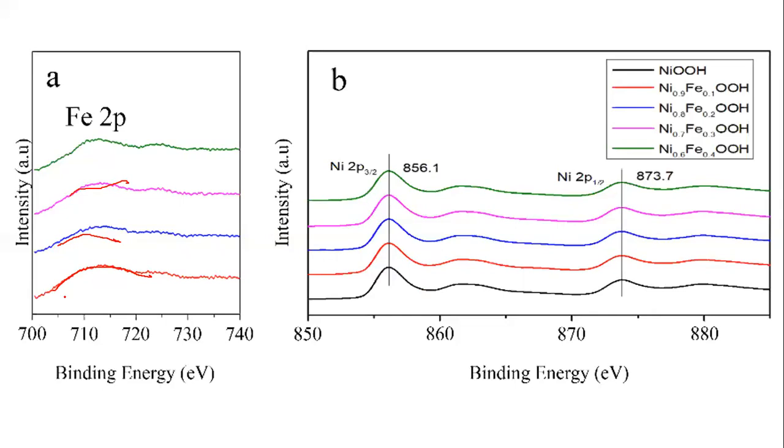Maybe you can ask the question, sir, how can I confirm the presence of iron, that it is iron from the peaks? It's a characterization. In XPS, the peak over here, that is 712, almost, because that is 710, that is 715. So 712 to 713, this peak is for iron. So we can easily understand.